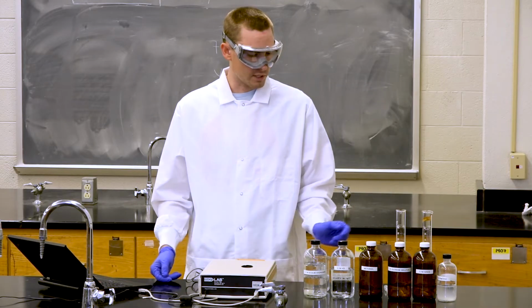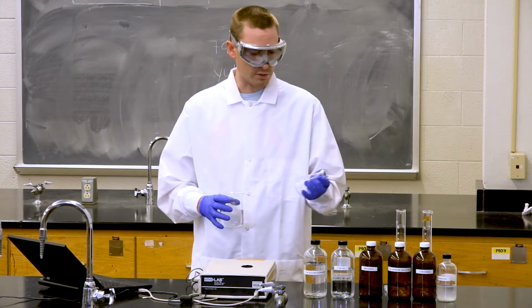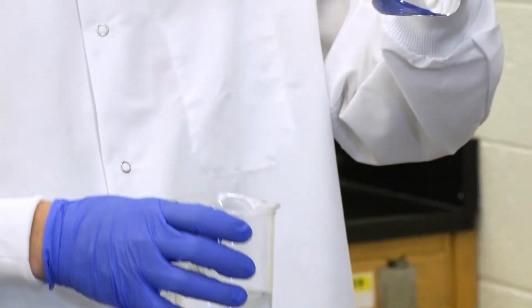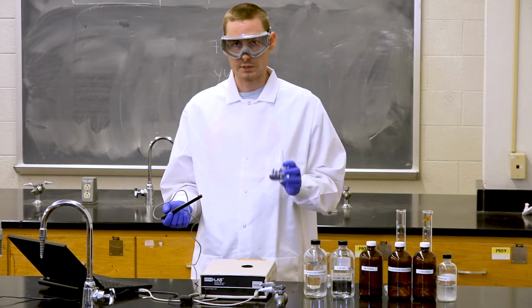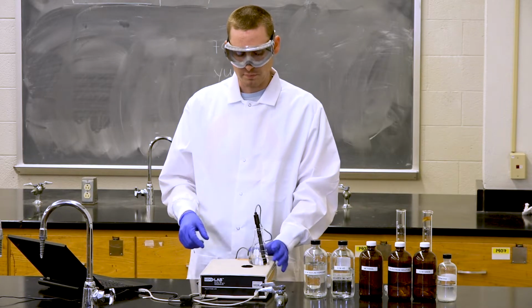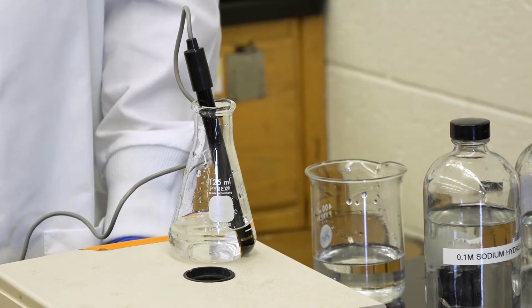So the first thing that we're going to measure is some distilled water that we got from our distilled water bottle. So we will add a little bit to an Erlenmeyer flask or any other type of beaker, just enough to cover the tip of the conductivity meter. Once you have your distilled water in a flask, then put in your conductivity meter, which will start measuring the conductance of this solution on your screen in the bottom right-hand corner.